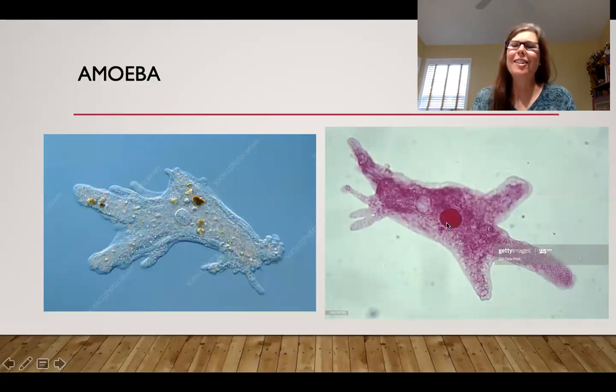So it has a really clear nucleus here, and you can also kind of see the other organelles inside there. And they move really slow.